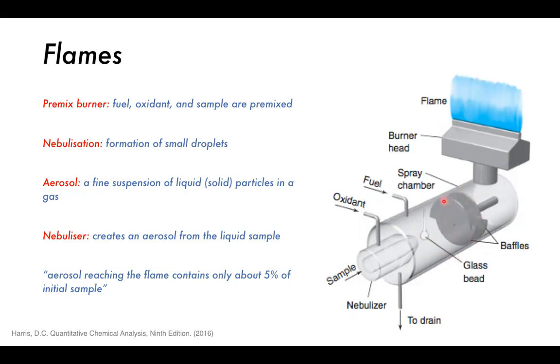Then the baffles will help to modulate the flow, so the flow is not too strong at times, too weak at times. It basically just makes sure that there's a continuous flow, and then it'll pass up through here, and the force of the gases passing through here is what pulls the sample up. Usually you can have a pump, but usually it's not necessary. Just the force of everything flowing through the flame is usually sufficient.